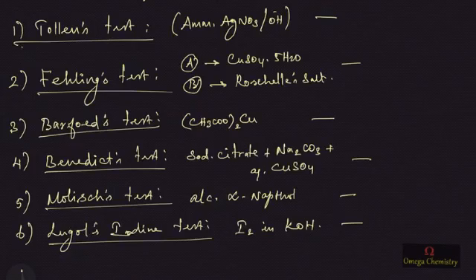answer. So when reducing sugars are added to ammoniacal silver nitrate solution in alkaline medium at elevated temperature, silver will be reduced and it will get precipitated, and thus the precipitated silver will stick on the inner walls of the test tube, which will make it a silver mirror, right? So fructose, which is a ketose, will also take part in this reaction after it tautomerizes to become an aldehyde group, and then it will answer. So the formation of a silver mirror is the indication for this test, right? And the important point is fructose will also answer this test.